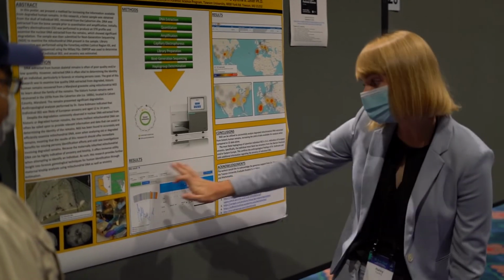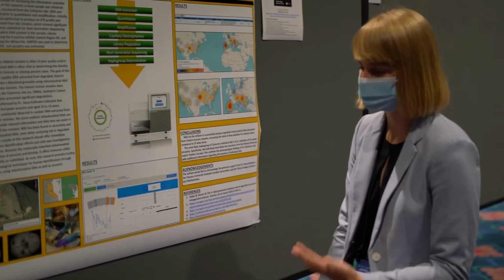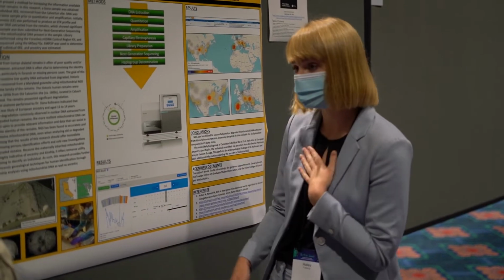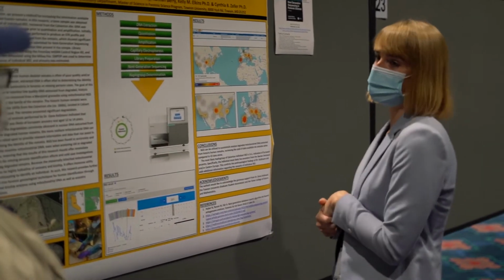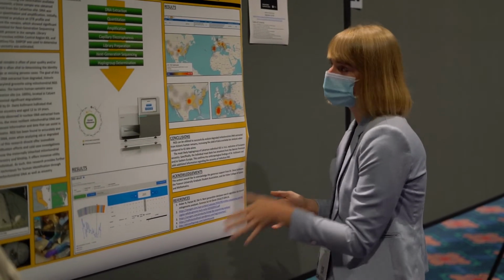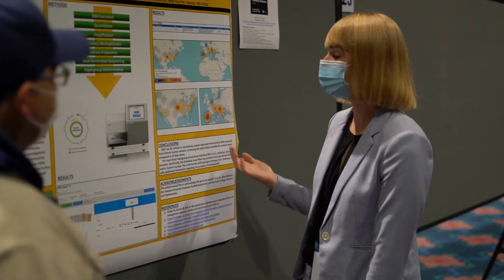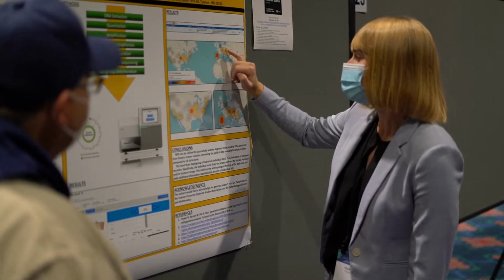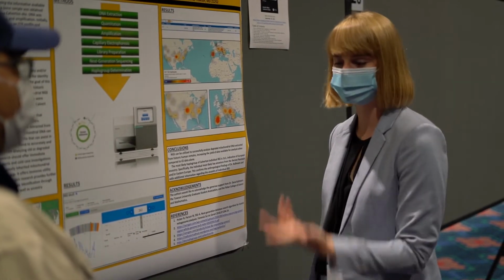So this was our results. Of course, with such old remains, we had some degraded DNA, so it wasn't a perfect profile, but I did get some really interesting peaks for their mitochondrial DNA to figure out their haplogroup. I entered in all of their SNPs into EMPOP, and then figured out the haplogroup. So this 12 to 14-year-old belongs to haplogroup J1c1, most likely. And the most common matches for that haplogroup are found here in Spain and Portugal, a little bit in Germany, and then Eastern Europe. So it's possible that person came from one of those regions.